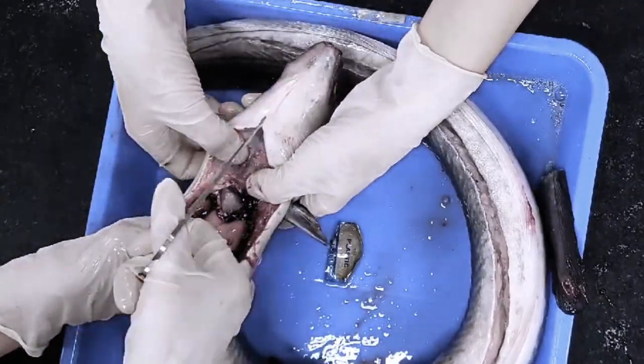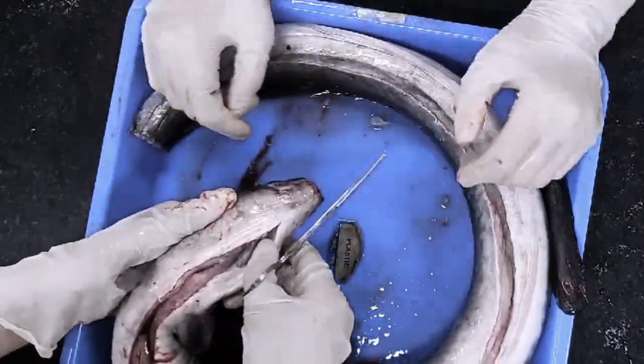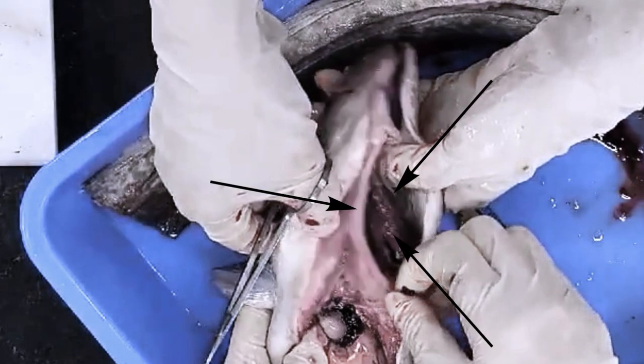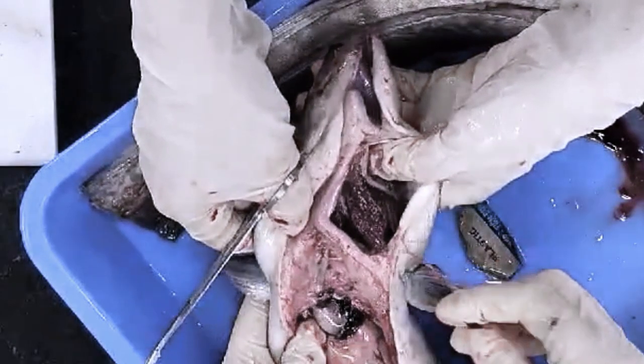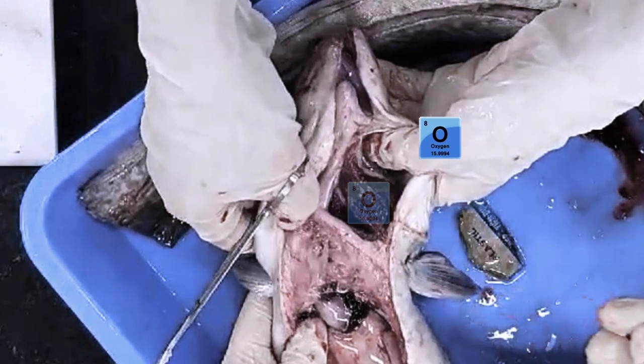Their gills are located on the sides of their heads and are covered by a bony plate called an operculum. They draw water in through their mouths, which passes over their gills, where dissolved oxygen is picked up, and is then expelled through openings called gill slits behind the operculum.